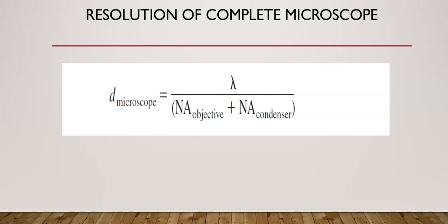Most of the microscopes have a condenser with a numerical aperture between 1.2 and 1.4. However, the condenser numerical aperture will not be much more than 0.9, unless the top of the condenser is oiled with the bottom of the slide. So during routine microscope use, the condenser usually is not oiled, and this will limit the overall resolution.